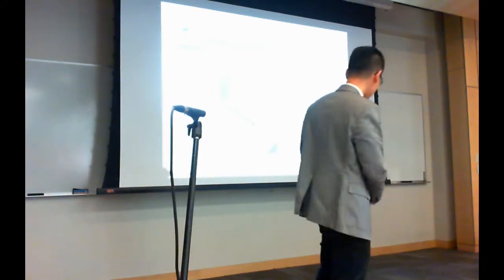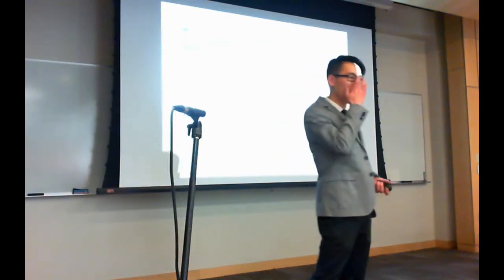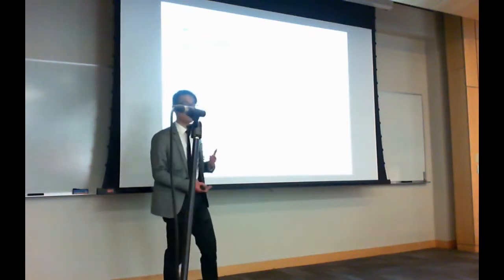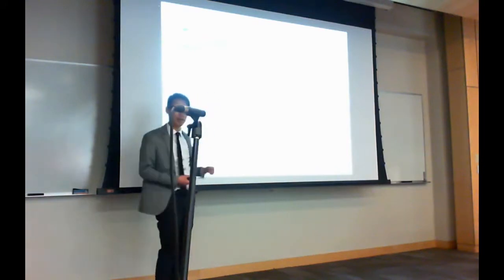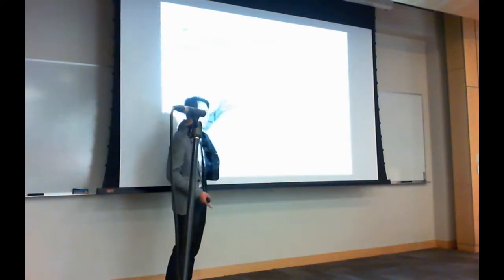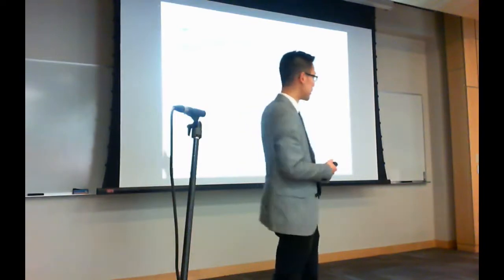And when we apply this to actually identifying spectra in samples, we can find here, at a 1% false discovery rate, where we fix the specificity, that our tool, called the SLGF approach, in rescoring these scores with significance, increases the sensitivity over the state-of-the-art library search tool, which is more or less cosine-based, by 16%.